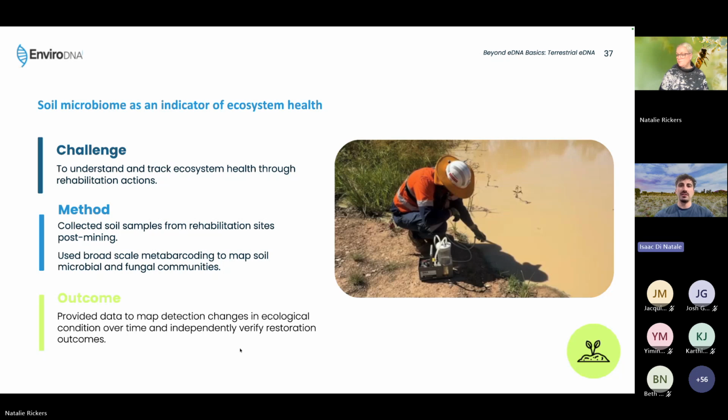So it's an approach that delivers very rich, comprehensive environmental data across a broad range of complex taxonomic groups that you would really struggle to monitor otherwise. So those really small microbial communities. And it reduces the need for intensive field surveys, as well as minimizing that disturbance to recovering ecosystems. And we see that soil biome analysis is increasingly becoming cemented as part of evidence-based rehabilitation, quite literally from the ground up, and it plays a key role in environmental impact assessments and some of those regulatory frameworks.